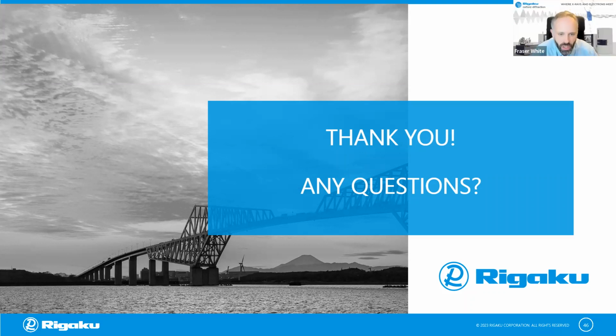Yeah. So they've jumped a little bit, but the next one I was going to ask, I noticed that electron diffraction data have relatively low completeness, possibly due to the restricted rotation of the sample in the vacuum chamber. How would you assure that data you're collecting has sufficient completeness for good refinement and publication?